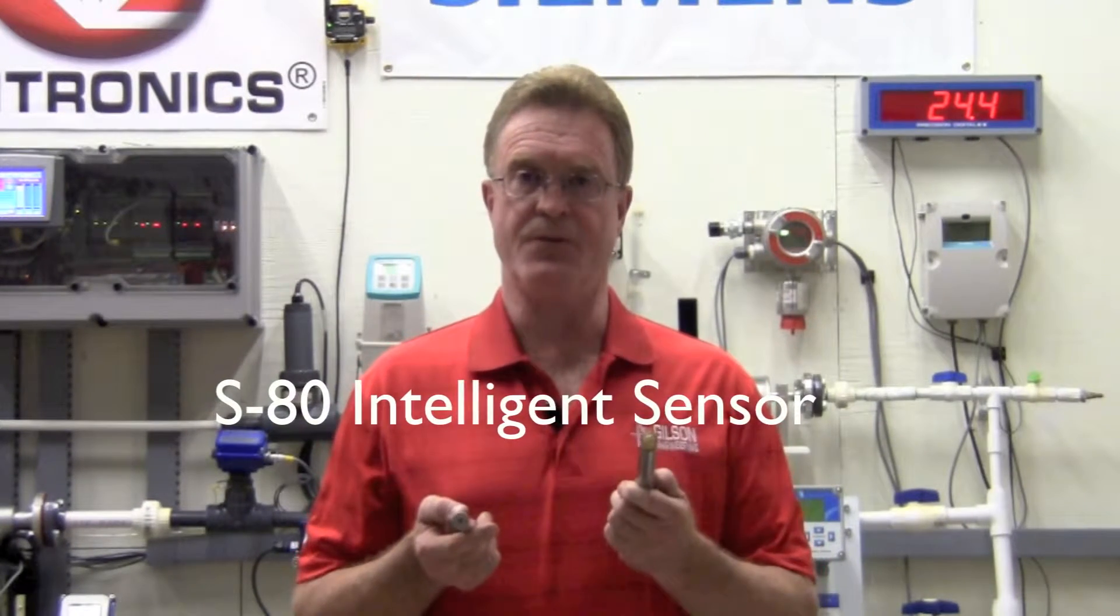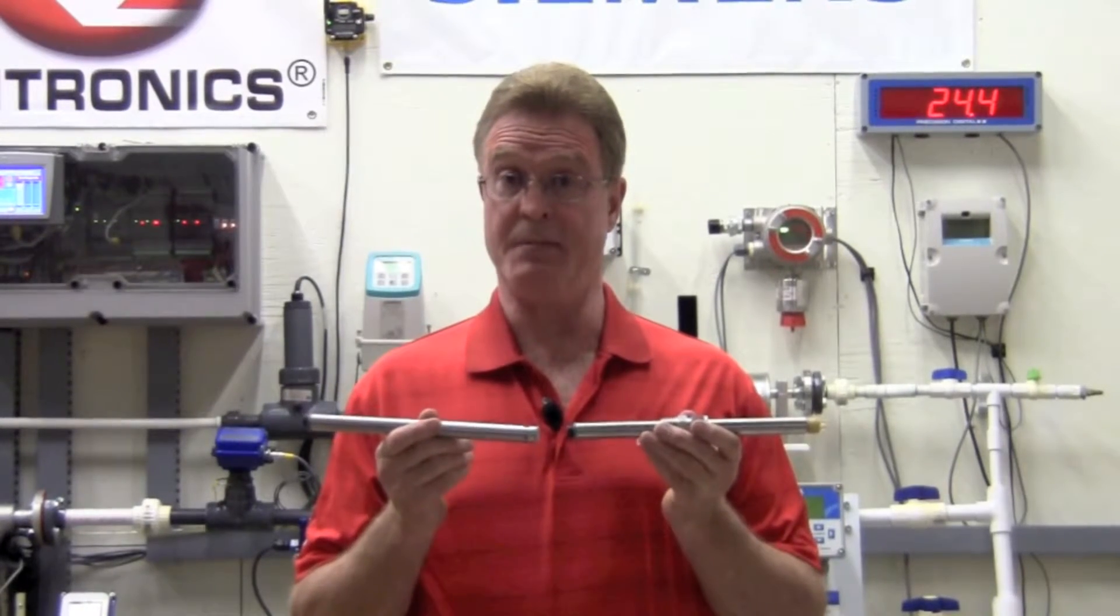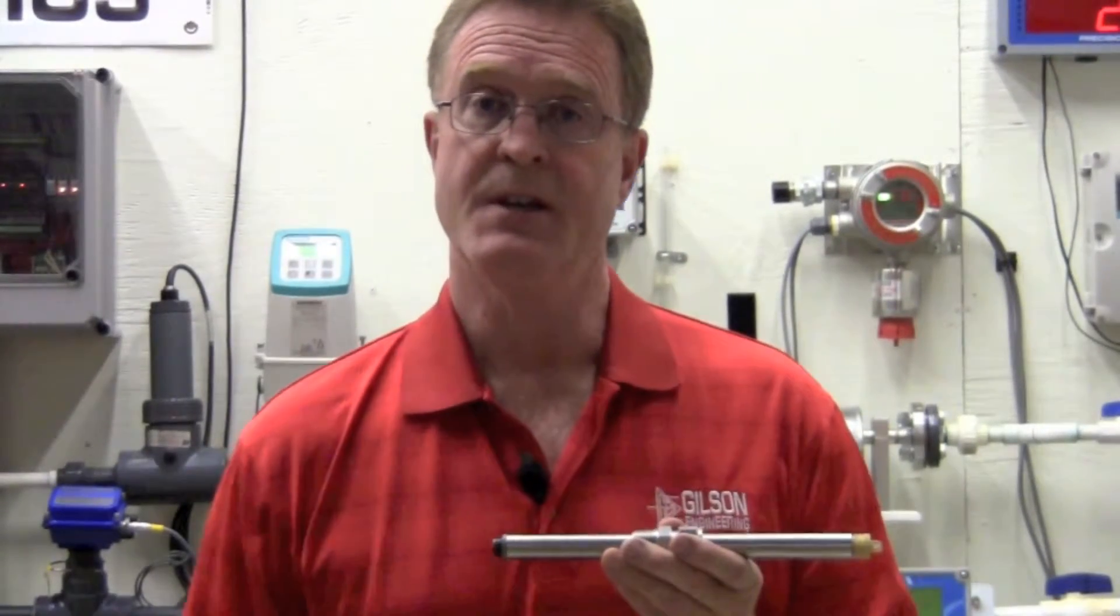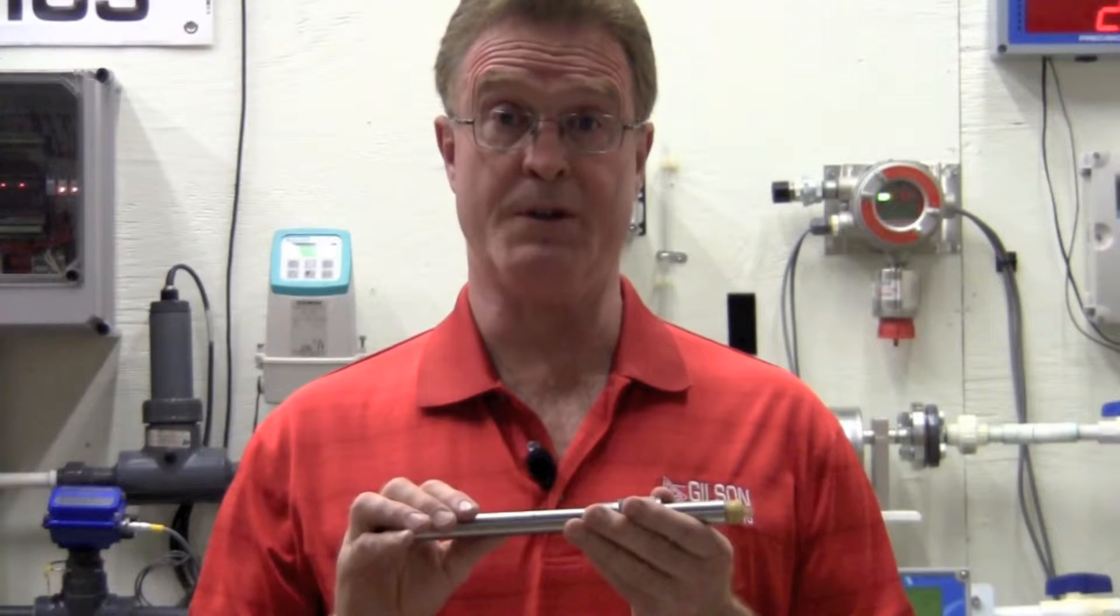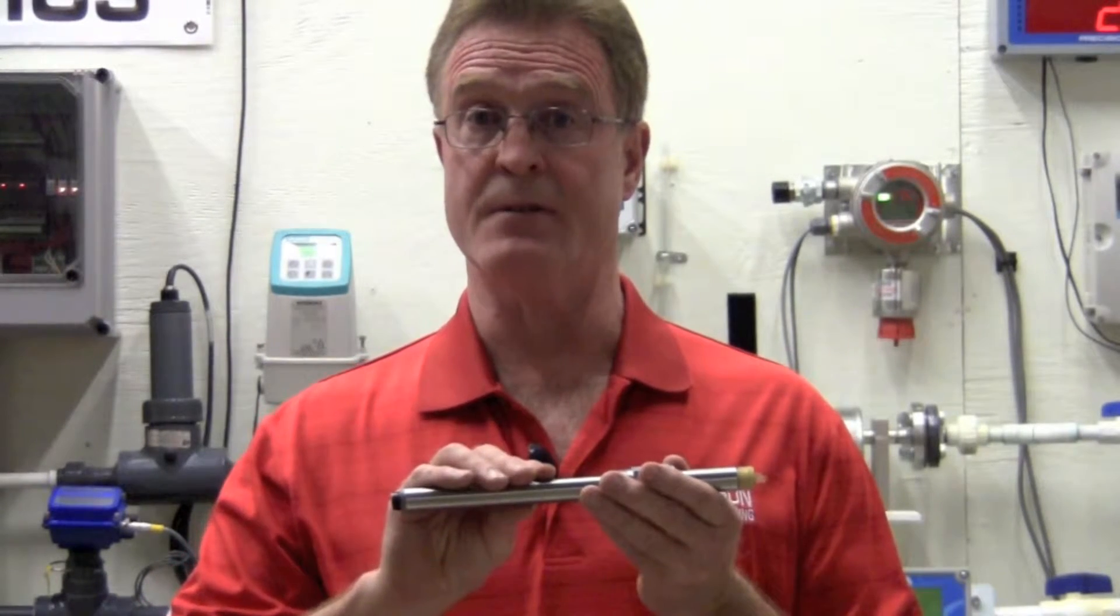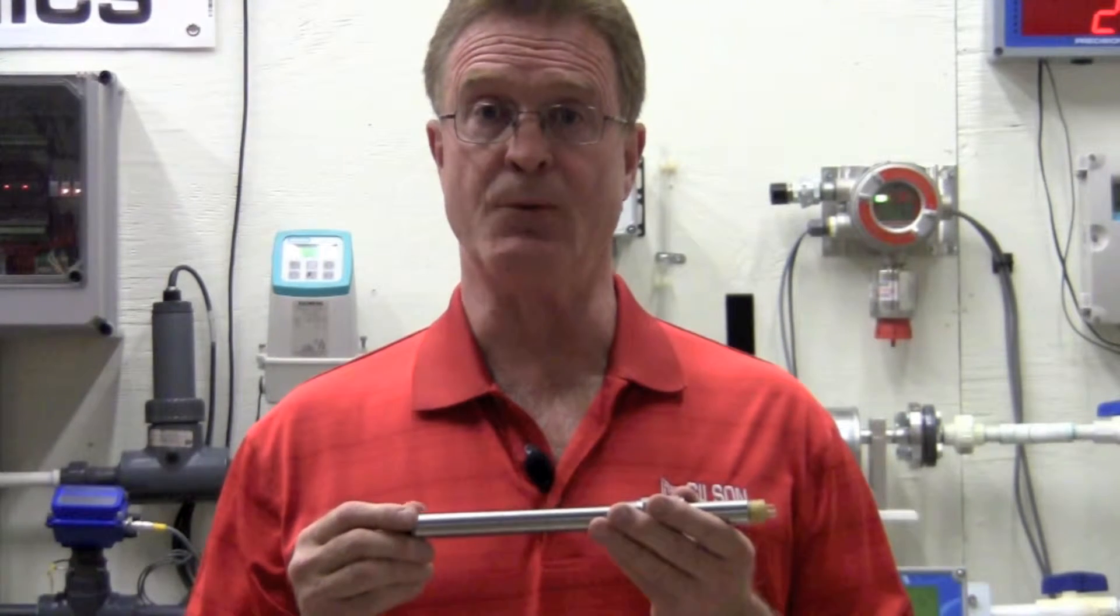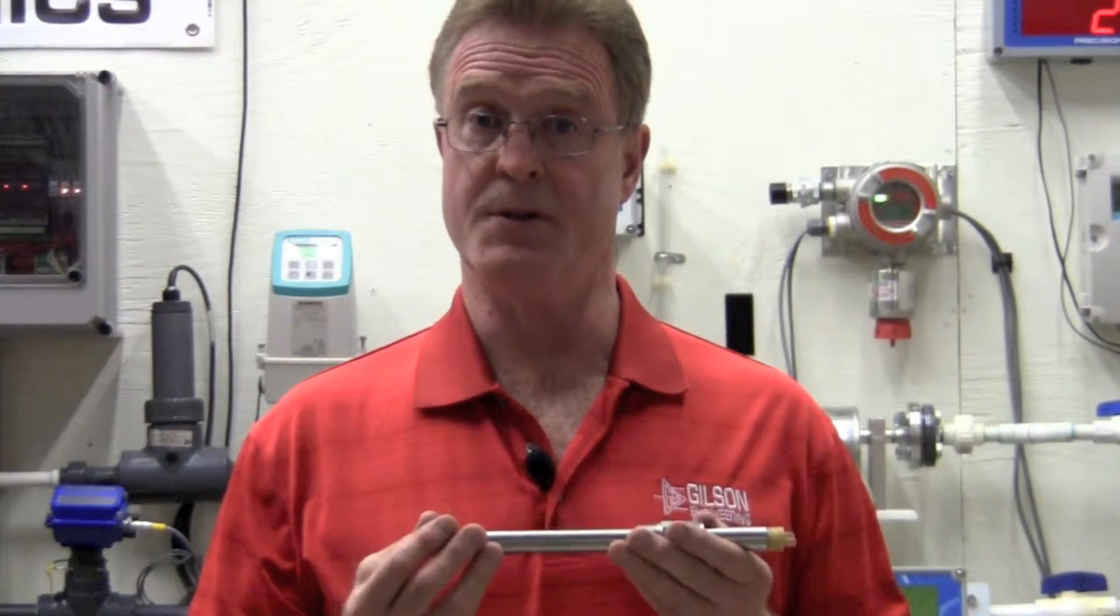In the intelligence series, we now call the immersion sensor an S80. Here I have an S80 with a pH front end. I also have an S80 with a conductivity front end. It's not only the front end, it's the internal amplifier. The biggest innovation from ECD with the intelligence series is that the zero and span, the millivolts corresponding to zero, seven pH, and span, either 4 or 10 buffer, are stored in the sensor. When I connect with the transmitter, the T80, it digitally reads what type of sensor it is, and then uploads from the sensor the zero and span values.